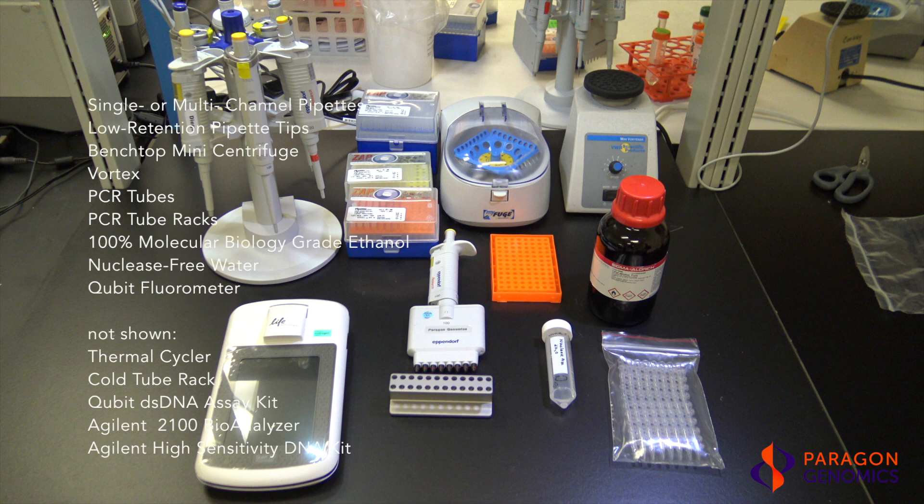You should have the following equipment and supplies to help you complete the protocol: single or multi-channel pipettes, low retention pipette tips, a benchtop mini centrifuge, a thermal cycler, a vortex, PCR tubes, PCR tube racks, and 100% molecular biology-grade ethanol.